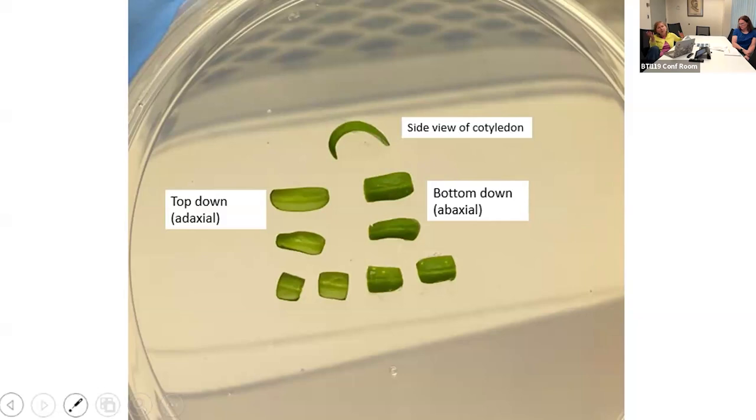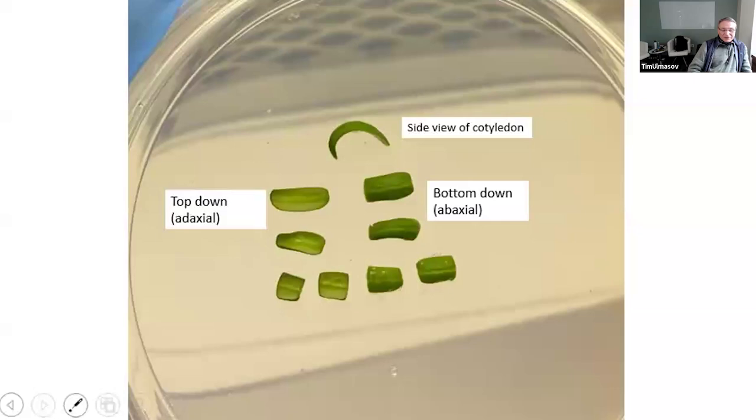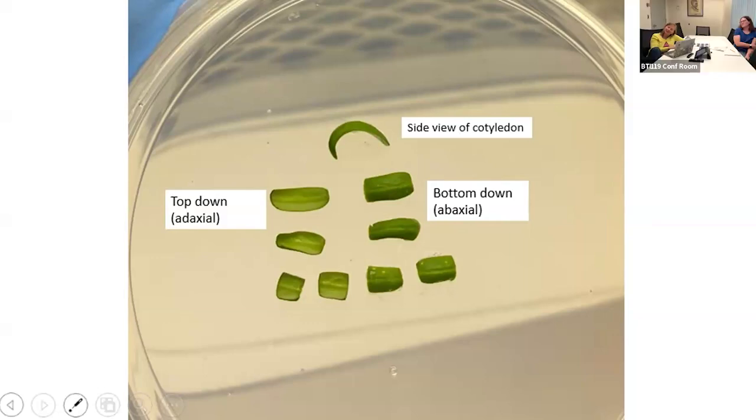You also have to make sure, when you're using auxotrophic strains, that your efficiency is good, because it doesn't necessarily mean you're going to get a good transformation efficiency. So that's another thing you need to check when you switch. Well, the people who developed the strains claim that the efficiency was not affected. Yeah, but it depends. I'm not that trusting.